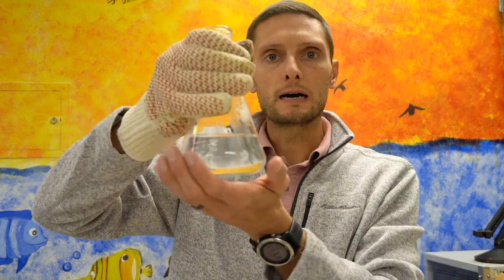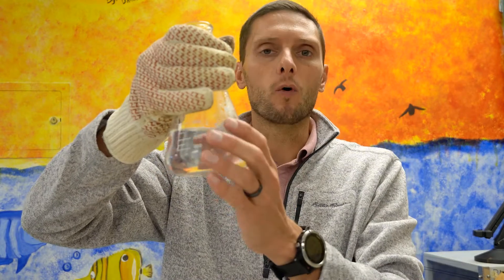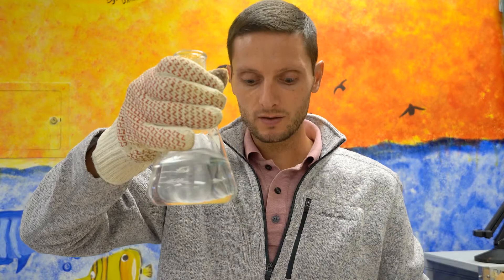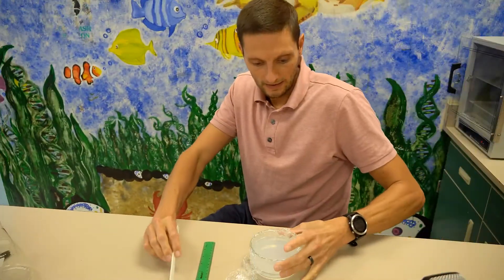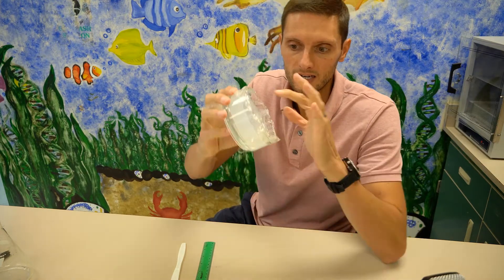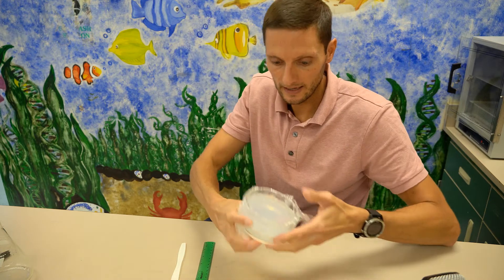Our mixture is pretty cool now — still warm but cool enough to touch without burning your hand. I'm going to go ahead and pour this into our container to allow it to solidify. Our agarose has now cooled and solidified into a jelly-like substance, similar to Jell-O.